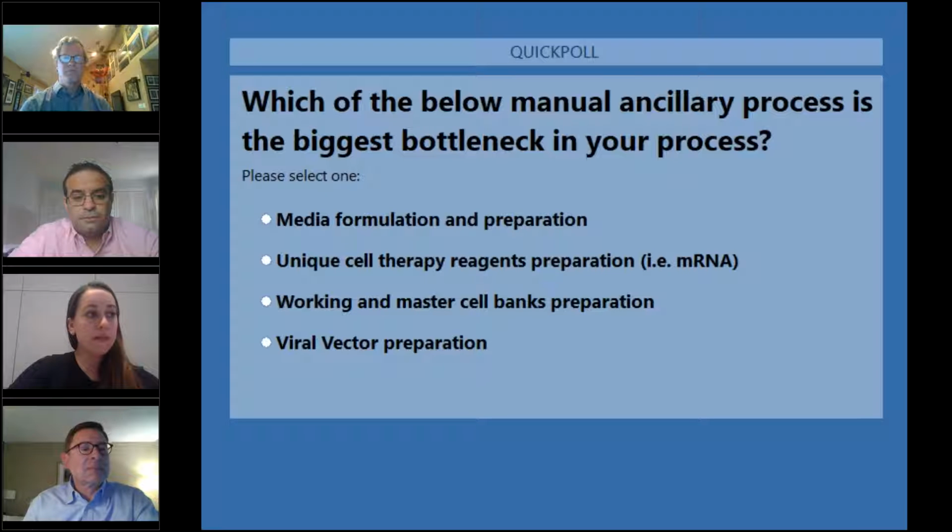Yeah, there's of course the challenge of when to automate, but I think there's always that challenge across the field also of finding the appropriate automation tool to automate those different pieces of the process. Cell therapies already have a lot of unique automation, but even looking across different therapies, different cell types, et cetera, you might need different sorts of automation, and choosing the right one for your cell therapy can be difficult.